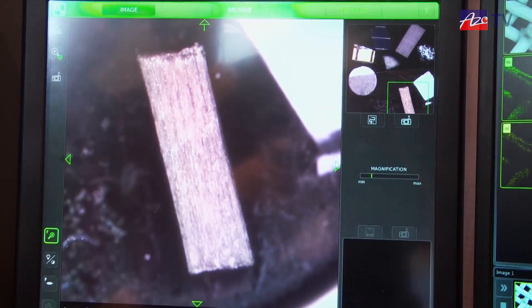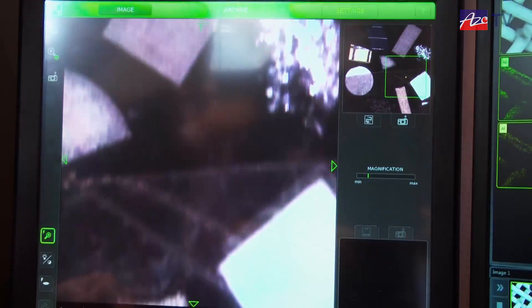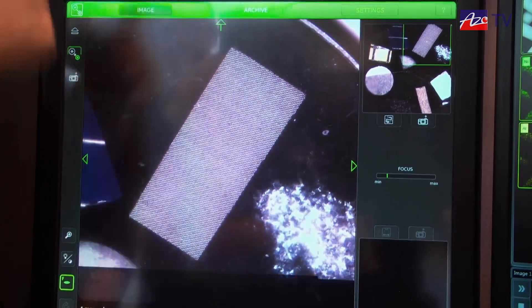As you can see, there are hardly any buttons. If I want to move the specimen, I just touch the image and the image is centered. Now this looks okay, so I'm thinking I would like to put this into the electron microscope. I touch this knob here and say enter, so now the specimen is driven into the electron microscope.